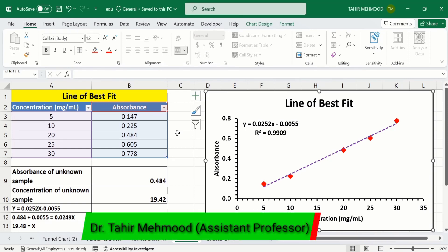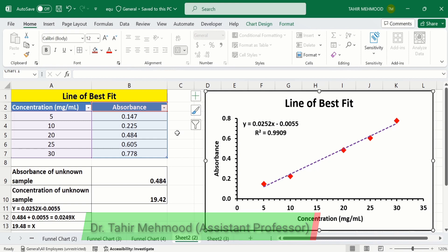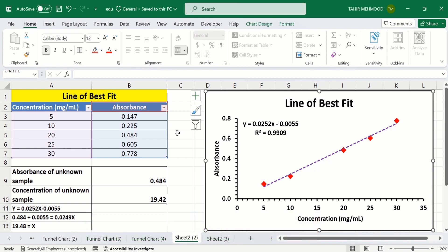In this video you will learn how to create a linear standard curve to determine the concentration of an unknown sample in Microsoft Excel. I have data about the concentration and absorbance of an unknown sample at particular concentrations.